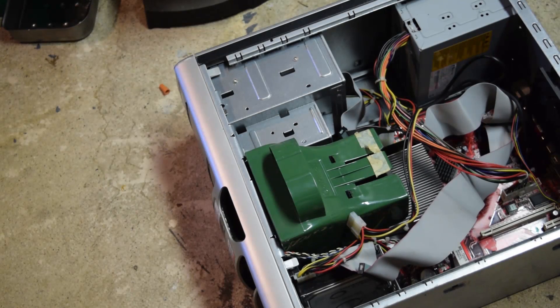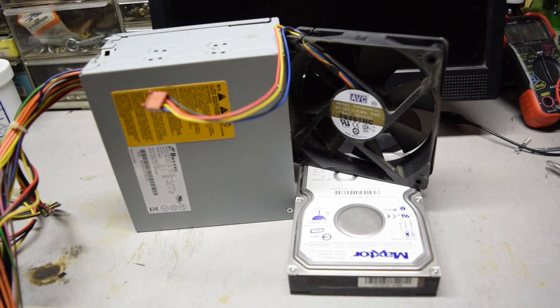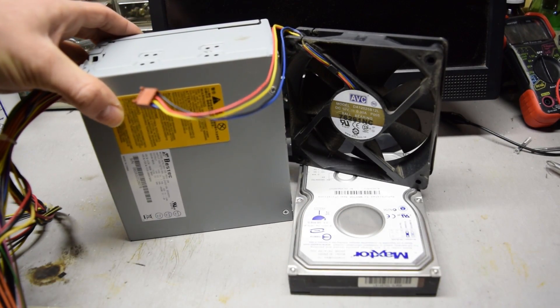Those are the only real parts that you'll need. The rest of the computer can be recycled. I'll remove those parts and go on to the next step. I've removed the power supply, the fan, and the hard drive from the computer and they can be set to the side for now.